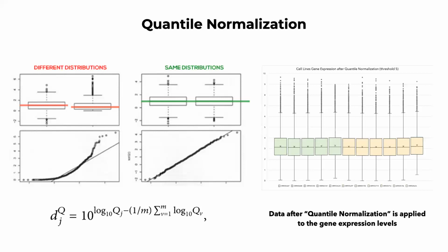On the flip side, why can we filter out the low expressed genes? Because the low expressed genes do not contain a lot of information. They probably play some supportive function that is very similar between any sample that we take. They're just responsible for maintaining some basic functionality that is common between all living cells in a particular organism. Now, in the middle, we have the bulk of our data, and that is really what's interesting to us, but that's where we need to find those significant genes.